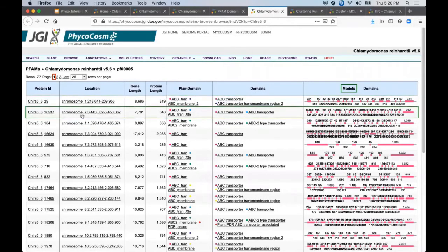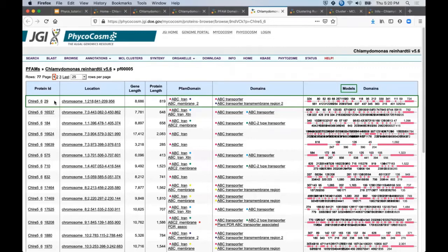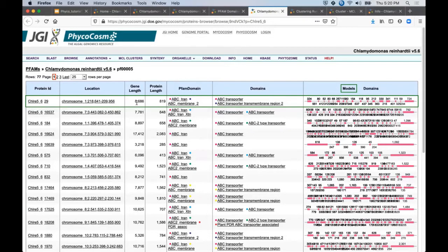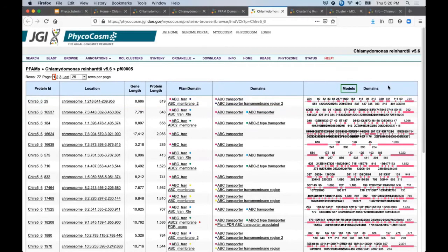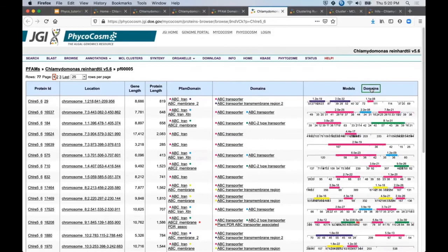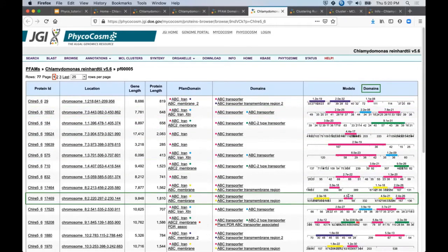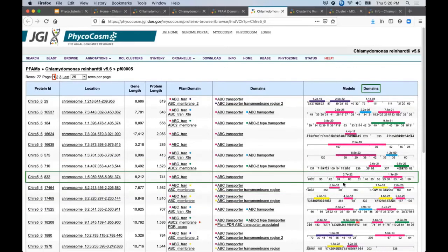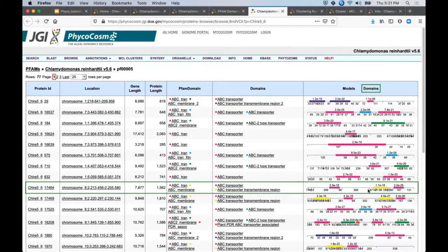Many of our annotation view details pages share tables like this one. Each row starts with a link to the genome portal and protein page for that particular gene model, a link to view this model on the genome browser followed by the lengths of the unspliced gene and the translated protein and any PFAM domain assignments. This rightmost column presents the model view of intron exon structure by default where we can click to switch to view the translated protein models with PFAM domain predictions color-coded to match the list to the left.